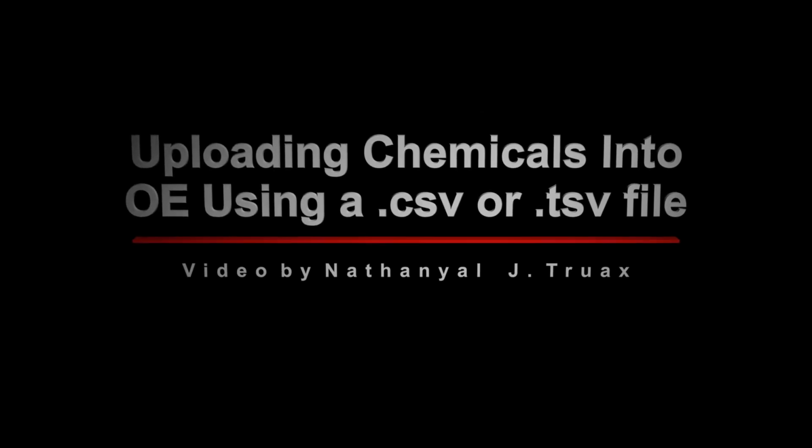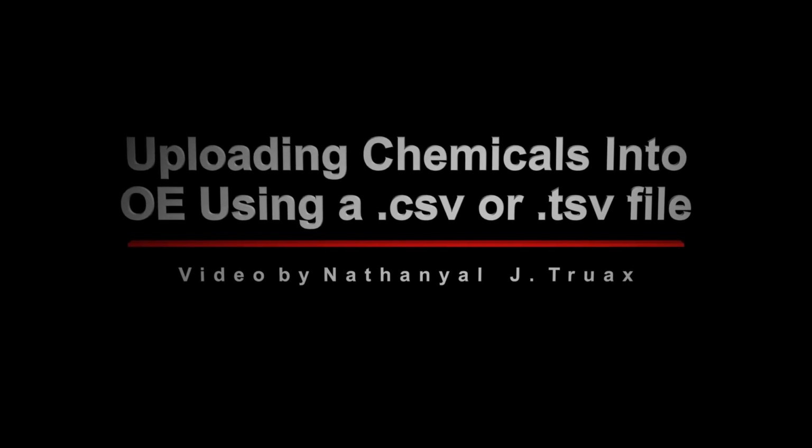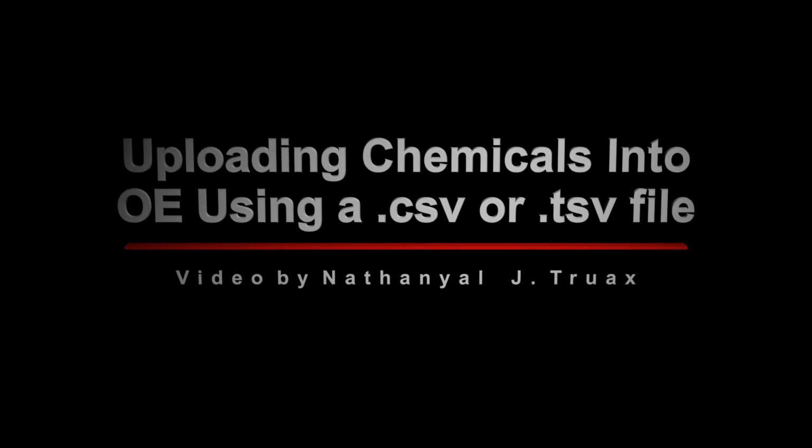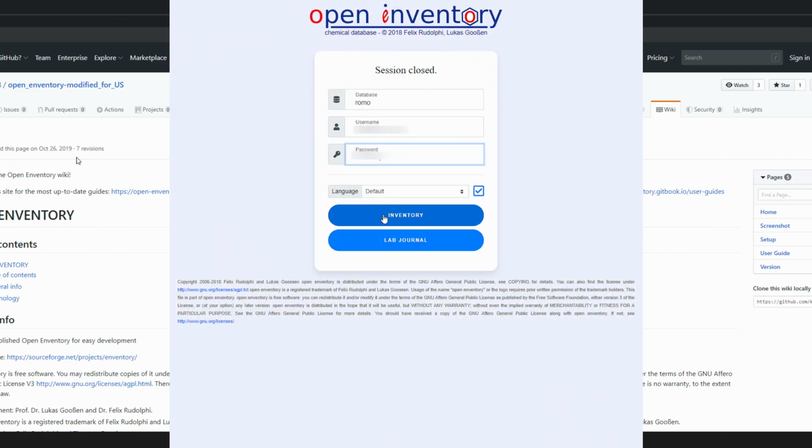Today I'm going to show you how to upload your chemical information using a .csv file or a tab-separated text file into Open Enventory. Note that currently uploading using a .csv file is only available using Koivon's distribution.